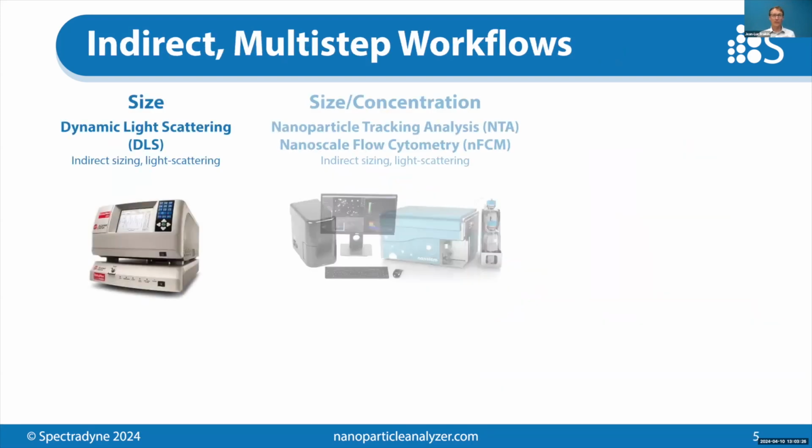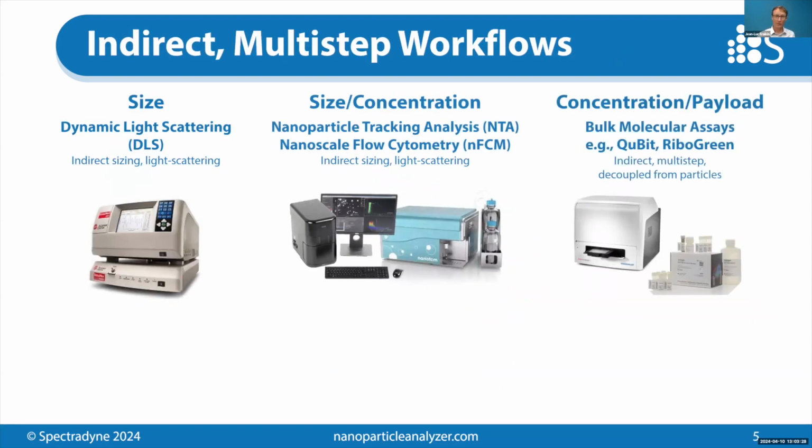Current ways for doing this are diverse. There are many different technologies out there for attempting to measure nanoparticles and characterize them, and you probably use a mix or maybe all of these methods. Typically there's a dynamic light scattering instrument in your LNP lab. This is an averaging method that reports an average scattering intensity diameter, not a real particle size distribution.